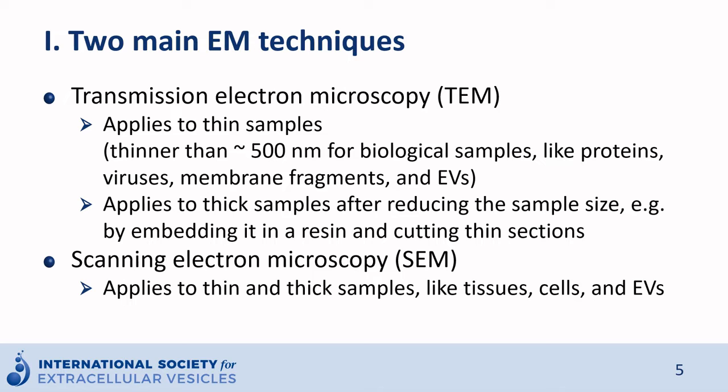TEM is used in the analysis of thin samples. Thin means below about 500 nanometer in the case of biological samples, which includes proteins, viruses, membrane fragments, and EVs.